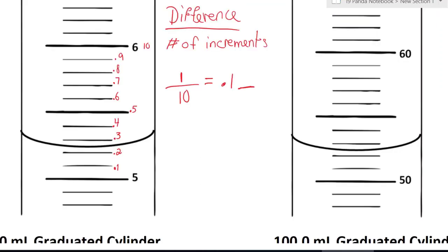Now we are going to learn how to read the measurements. This is what you're going to see when you have a liquid in your graduated cylinder. This is the water line. Now when we do our reading, we look at the lowest curve or the lowest point, which is called the meniscus.